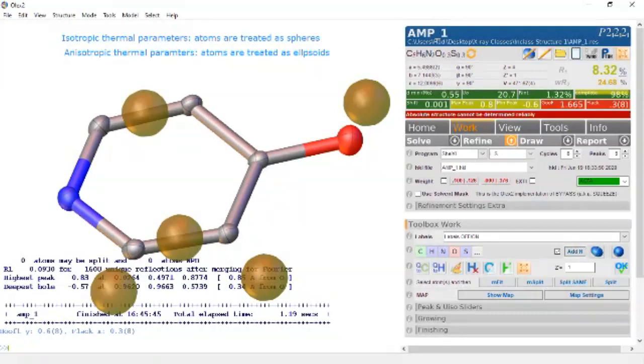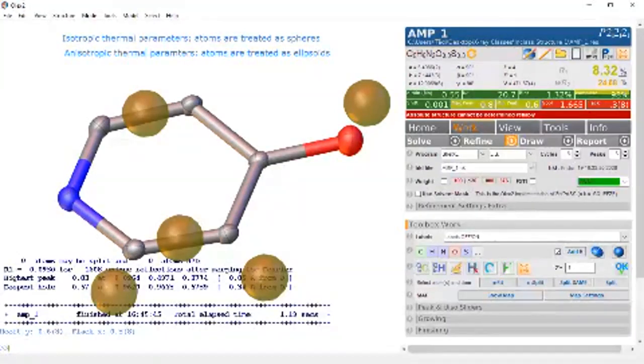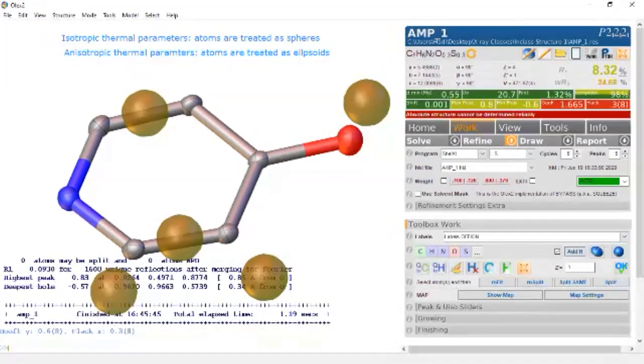The same thing for wR2. You have the calculated weighted structure factors and the observed, and now we use a weight there and we compare them, and the lower it is, the better the model fits the experimental data. So that's all we're doing with R1 and R2: we're taking our model that we've made, calculating the structure factors, and comparing them to the observed structure factors to see how well they fit. So right now we're at about 8% R1 and wR2 is about 25%. Not bad, we still have a few tricks to do.